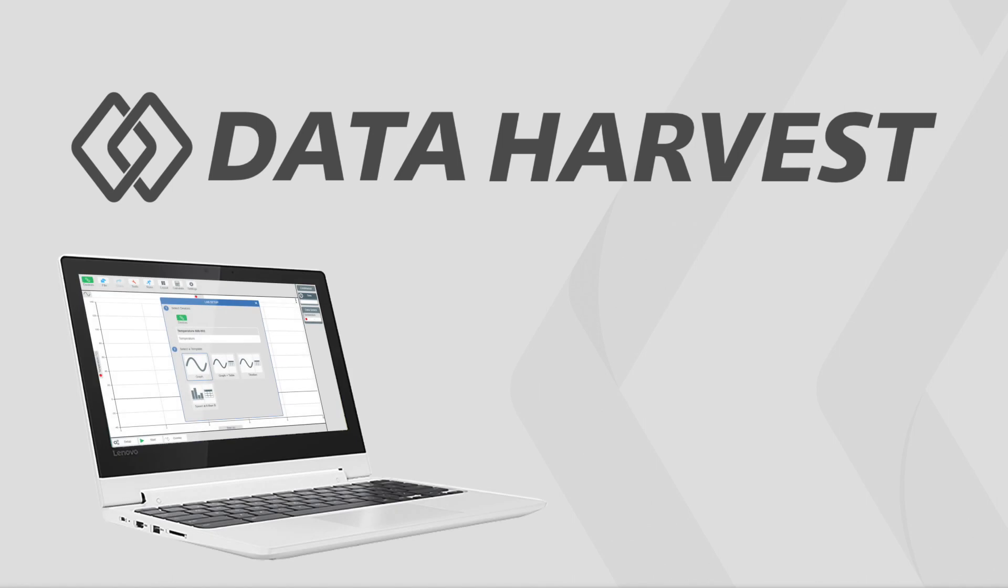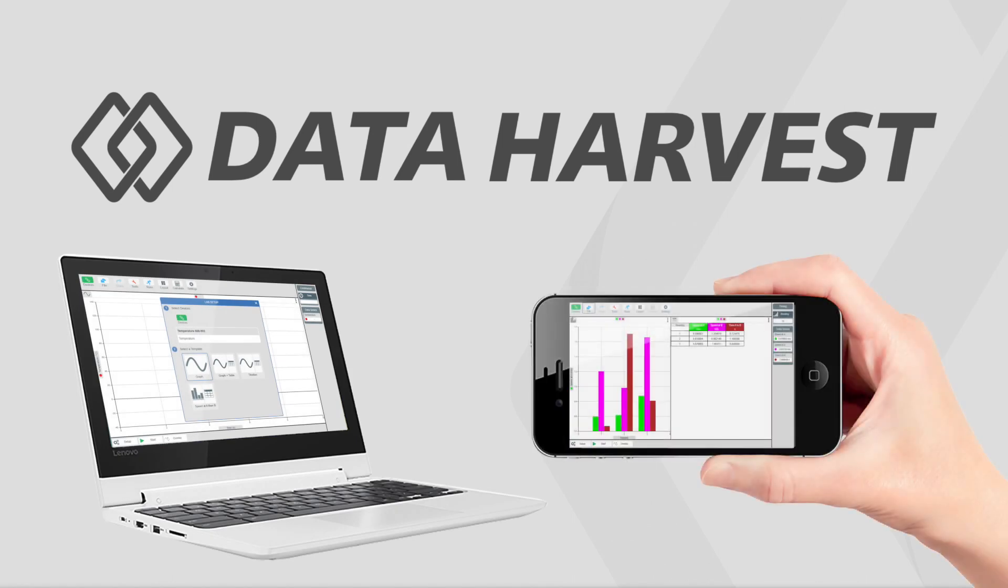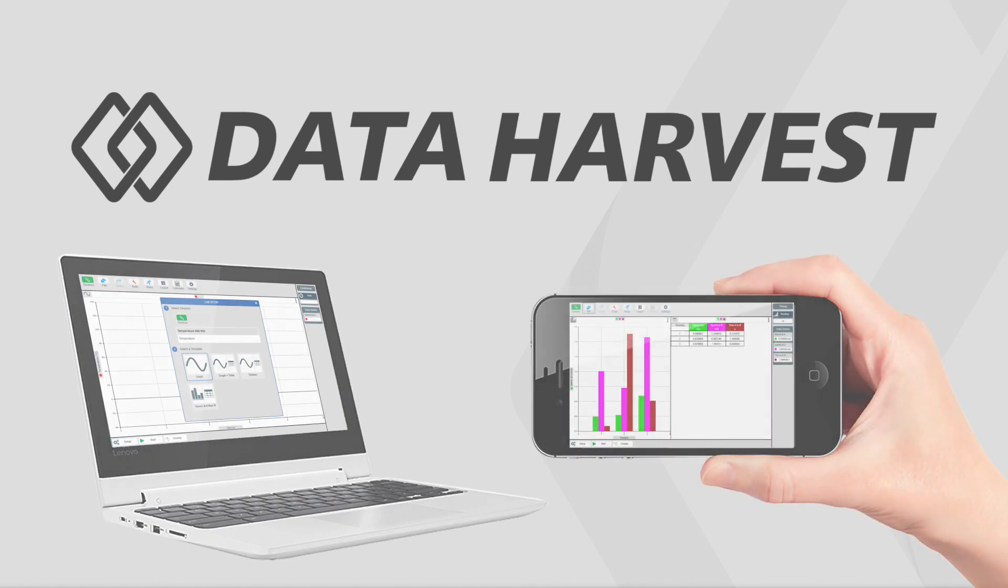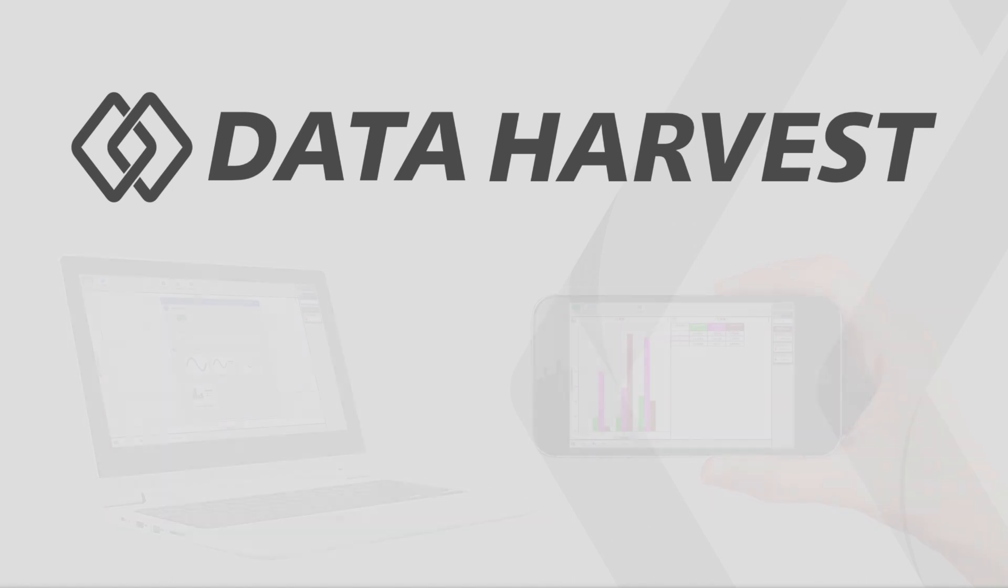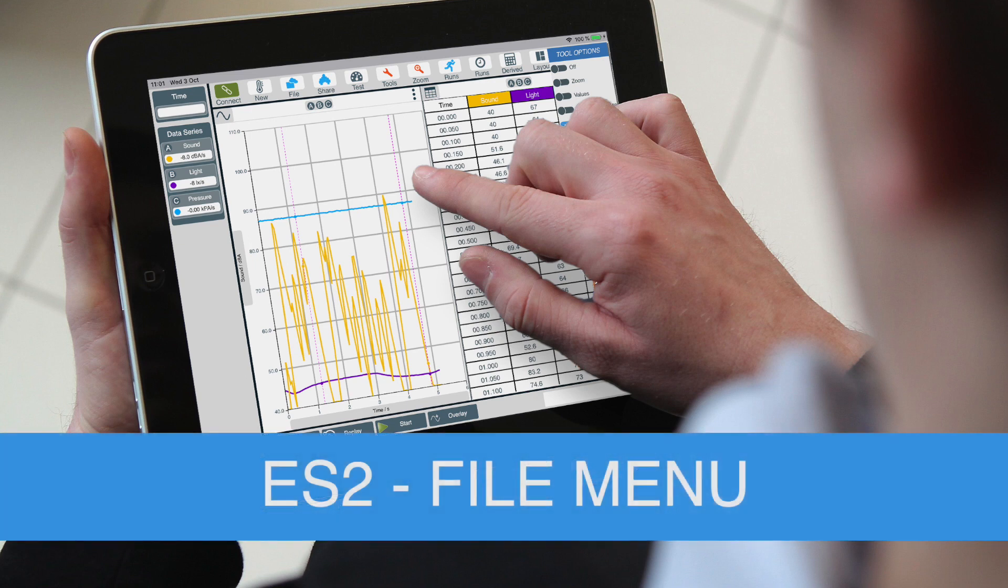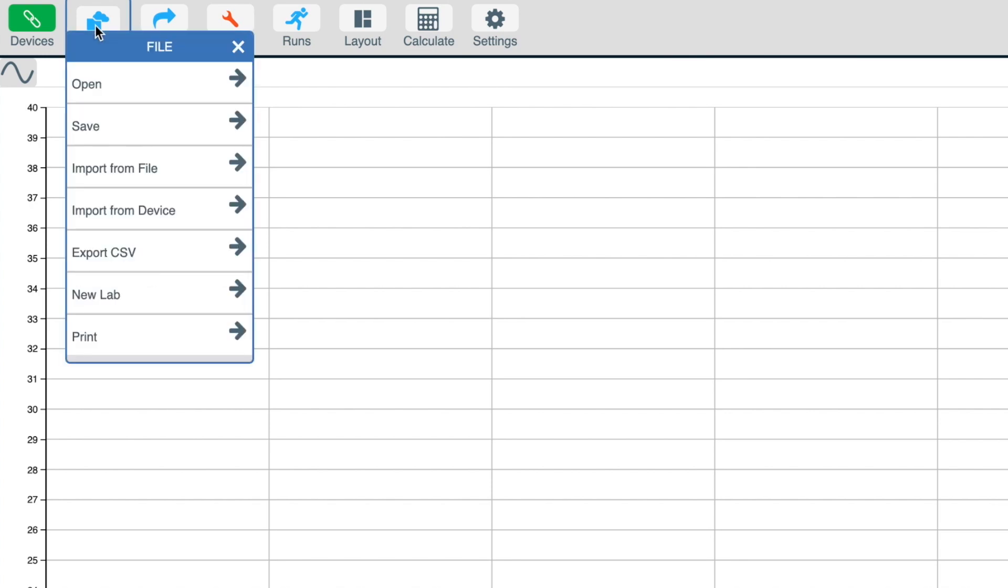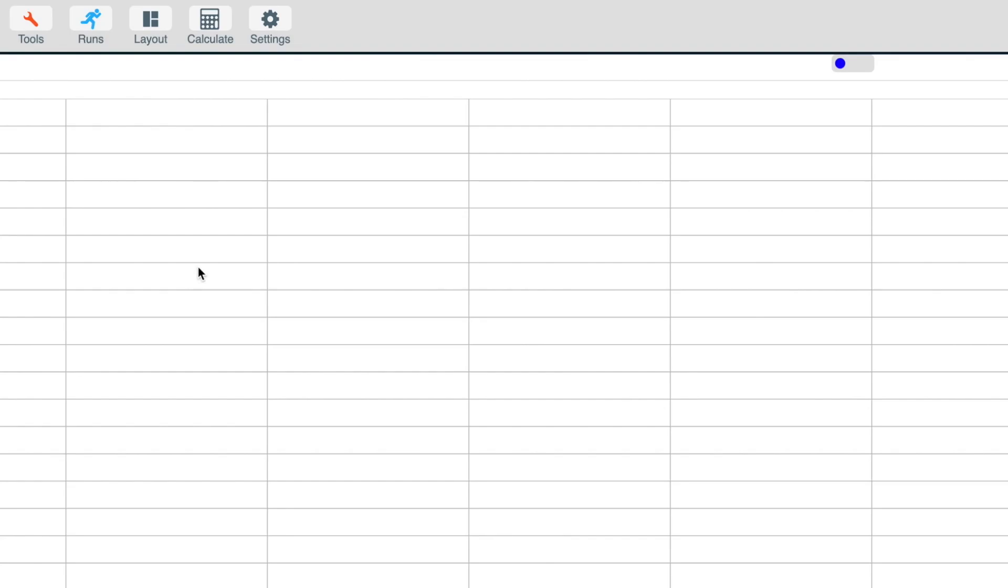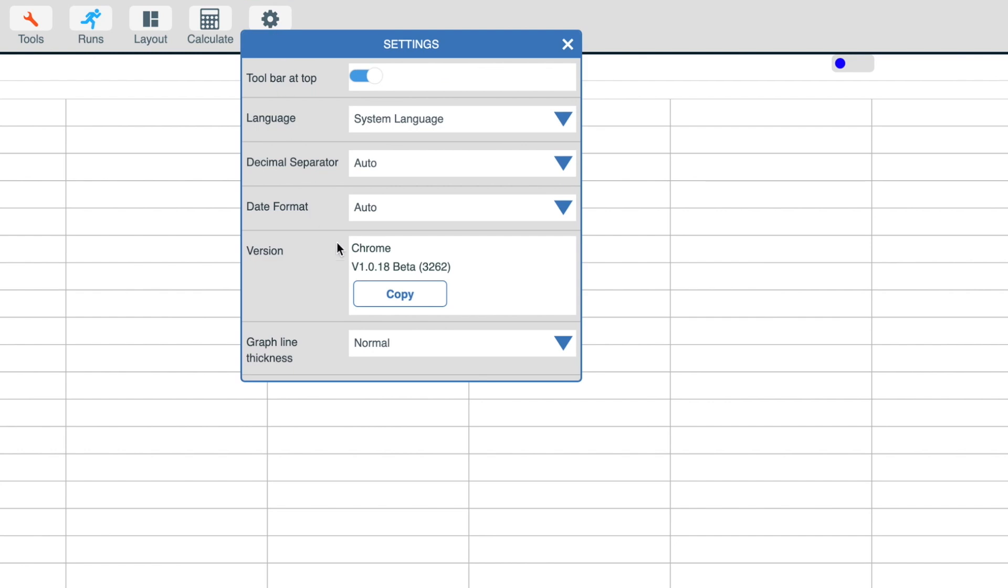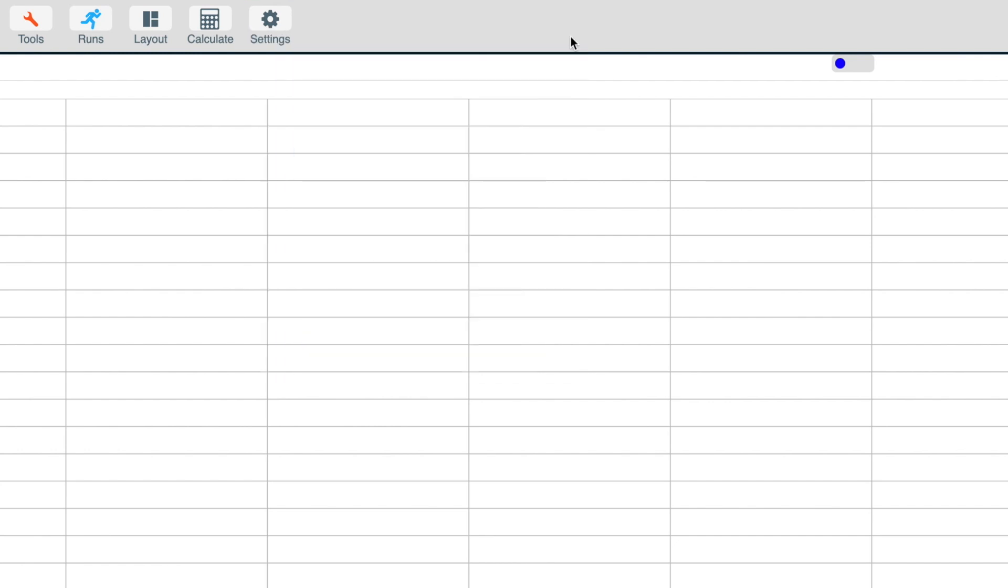In this video, we're going to further explore the EasySense 2 file menu. The file menu gives you options to open, save, import, export, create a new lab and print. In this version of the EasySense 2 software, we're using version 1.0.18.